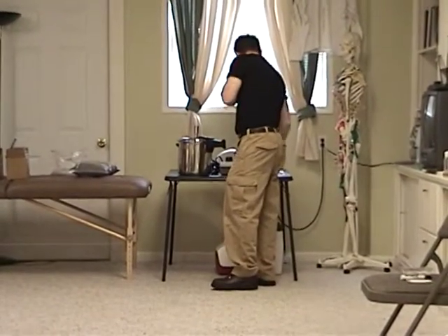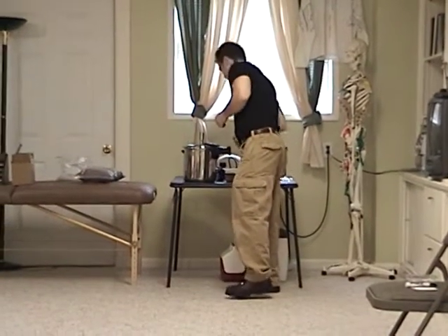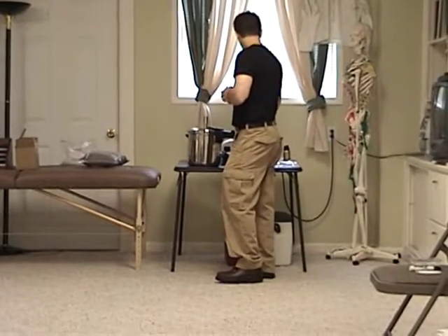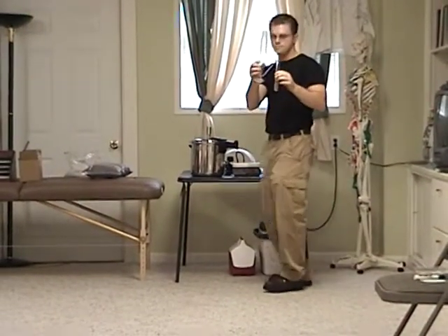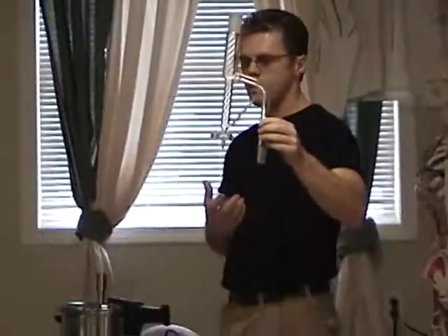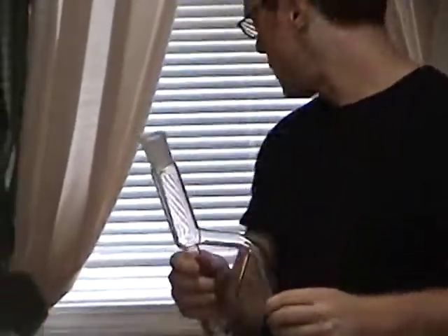I needed something that was small scale, that wasn't expensive, and there was nothing available. So I contacted the glass blower and had them design me a Clevenger. This is called a Clevenger — this is what is actually used to collect the oil, a distillation head used to collect it.